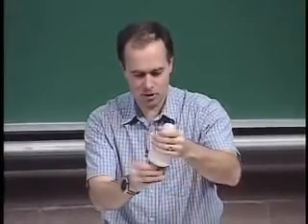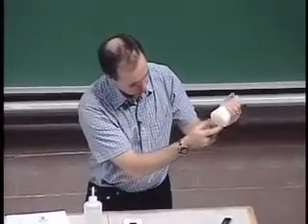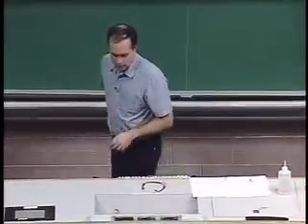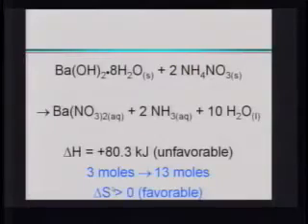Not going to let go. That's when it'll break off. Actually, oh, there. Yeah, so there's a little chunk of ice. I don't know if you can see it from where you are, but there's some ice on the bottom of this thing. So it actually took it down to below 0. It's so endothermic, plus 80 kilojoules per mole, and yet the reaction goes, and it does so because the entropy change is so large and positive.